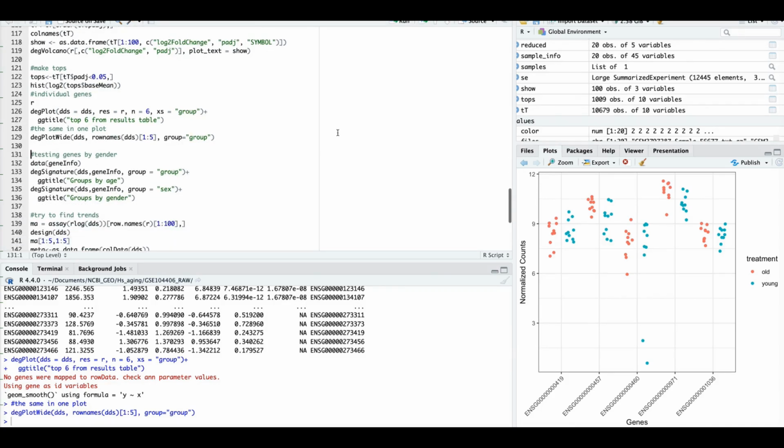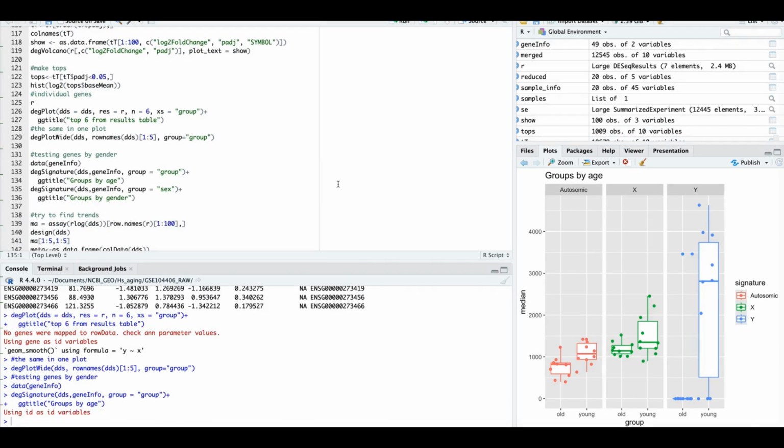Okay, next. This is probably the most interesting figure in the context of this data, where you test expression on X and Y chromosomes compared to autosomic expressions of reference genes. It has to be equal. It's not really equal, but okay. Then X is also balanced sufficiently well compared to autosomic, but Y chromosome is severely disbalanced, even though you define groups by age. So it's not supposed to be like this.